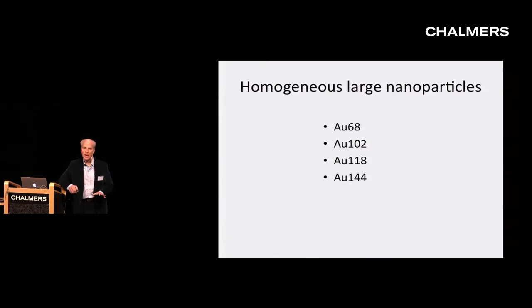Now, there had been many attempts to solve structures of large metal particles by this approach in the past, and they were invariably unsuccessful. Maya Azubel realized that not only are molecules made of light atoms like proteins susceptible to damage by an electron beam, but also these particles formed from heavy atoms, and she applied the same low-dose approach used to solve protein structures by cryo-EM to these gold nanoparticles.